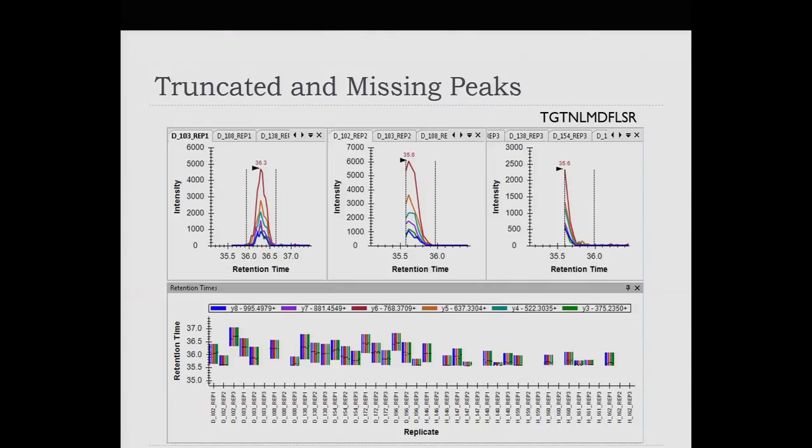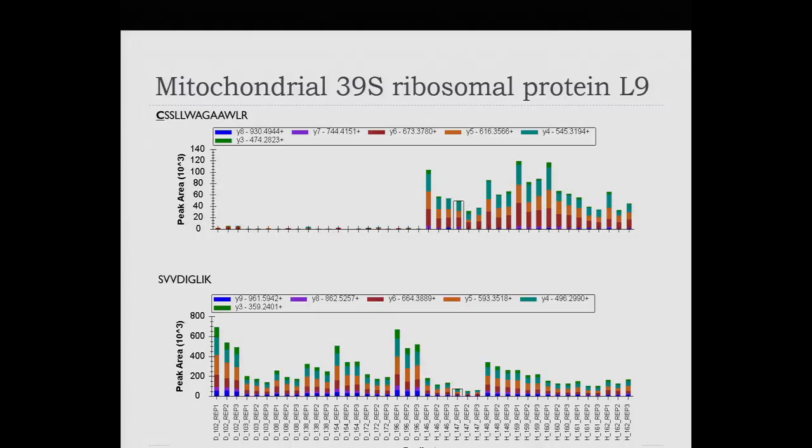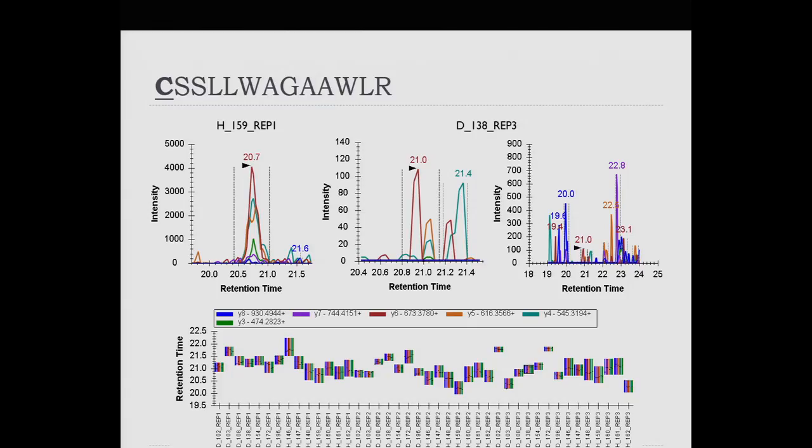So I feel pretty confident that there is actually something going on here. This might be a reasonable biomarker candidate. I would probably take it to my next phase of investigation, and that's what refinement is all about.